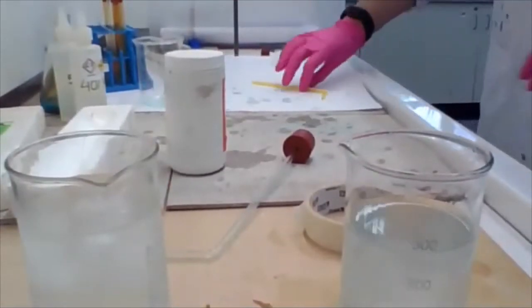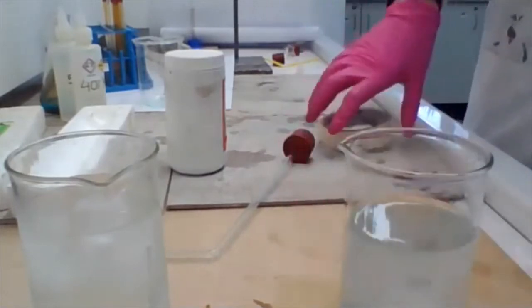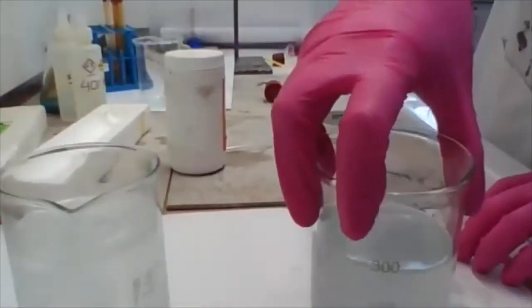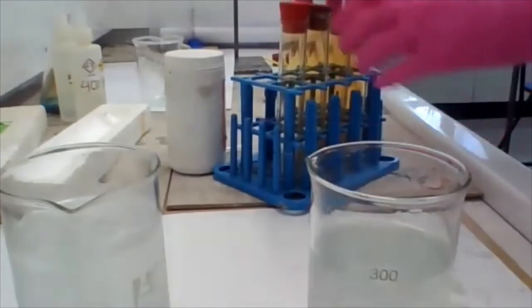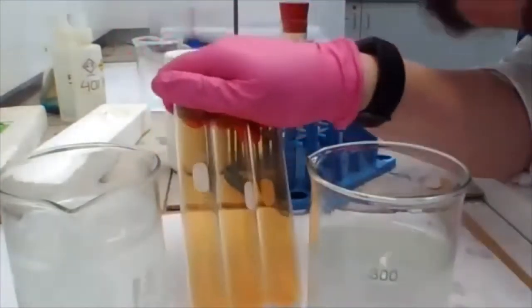Okay, so you can see there I've got my ice water on the left of screen and my hot water on the right of screen. I'm just getting a piece of white paper to act as a backdrop for us to make it a little bit clearer. It is difficult when you are playing with a set of chemicals inside a fume cupboard and you've got laptop set up. So I've grabbed those 3 test tubes.